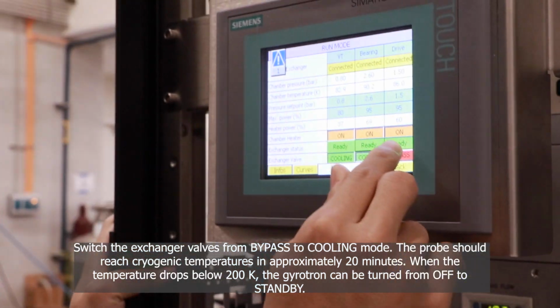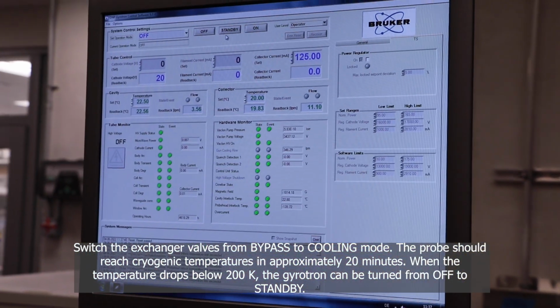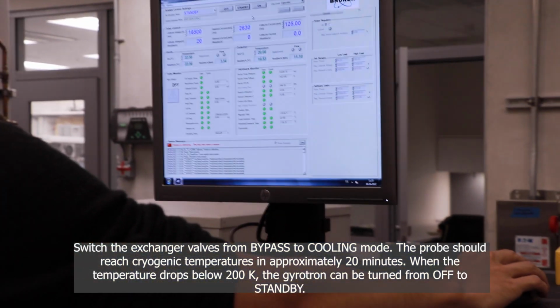Switch the exchanger valves from bypass to cooling, and now the probe usually takes 20 minutes to cool. Feel free to turn on the microwave after that and start spinning.